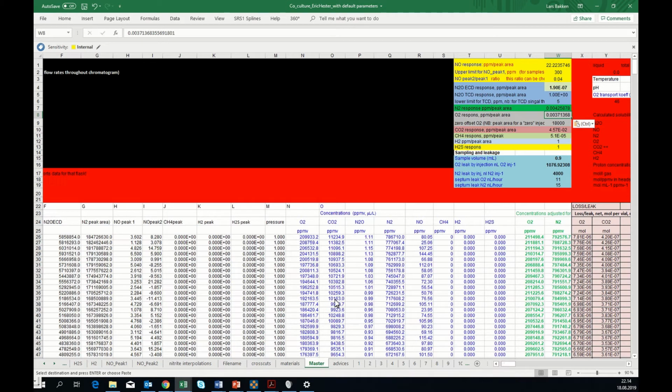So now we have almost the correct oxygen value, not exactly, and the reason for that is the 0 offset for oxygen. If that had been 0, I can do that now to show you. I will get 210,000 ppm in my first sample. Now I'll get back to the 0 offset. We actually need that for correct calculations of low oxygen concentrations. But as I said, I will get back to that.